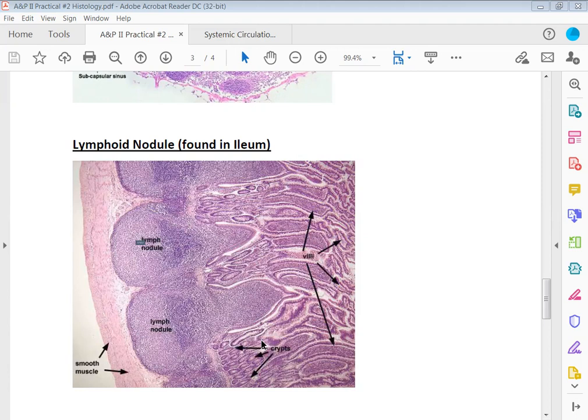If I pointed to this larger structure up top and asked you what this structure is, you would tell me an artery. If I pointed to this smaller structure down here and asked you what this structure is, you would tell me a vein. Okay, that's all for the histology for AP2 practical 2.